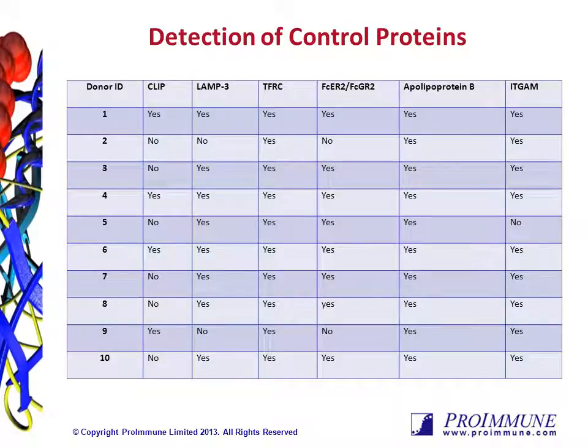To make sure that the assay works, we look for self-proteins that we know should usually be presented. For projects involving human disease, we look at several proteins that occur in most of the samples we measure. One of our acceptance criteria for the assay is that we find sufficient presentation from such proteins in each donor.